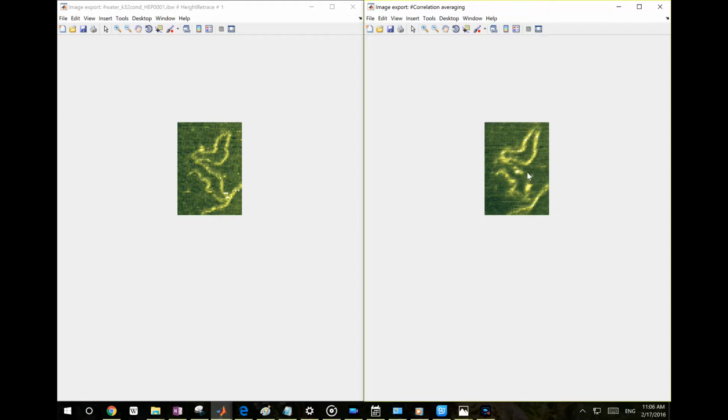It kind of disappears, and some dynamics also appears at the top of this circular DNA. So this is very useful, especially if your molecules are drifting. That can be corrected in this example. You also can observe some dynamics. If they don't add up perfectly in the average results, you see them disappear instead of enhanced, and I mean there's some kind of dynamics of the DNA molecule.